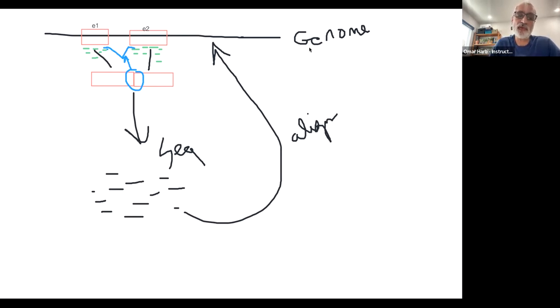So now these reads that are split, right? Anytime a read gets split on the genome, because a part of it aligns to one exon and the other part aligns to the second exon, this is evidence that this intron exists, right? So this is actual real evidence, real RNA sequence evidence that this intron exists. And the more reads you get that align to this region, the more evidence you have that this intron exists. Okay. So we take advantage of this.